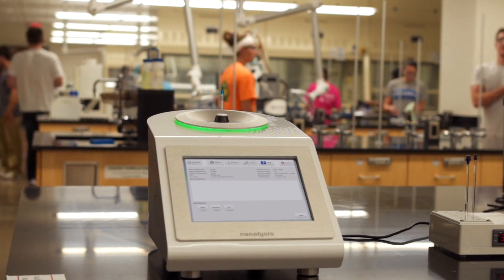Prior to having the benchtop NMRs, we had to provide pre-printed spectra to all of our students, and that really wasn't a good measure of them being able to see what they had actually made in the laboratory. So having the benchtop NMR allows them to get a spectrum of their actual product.